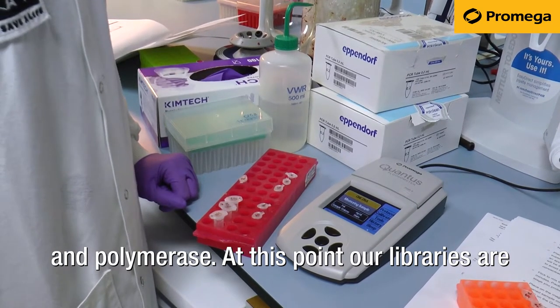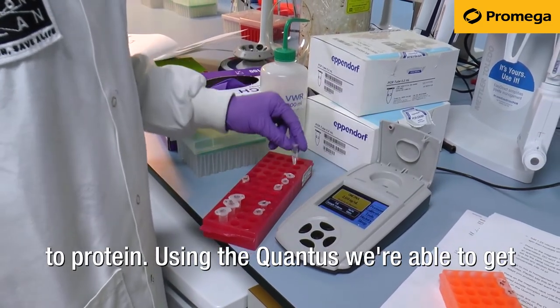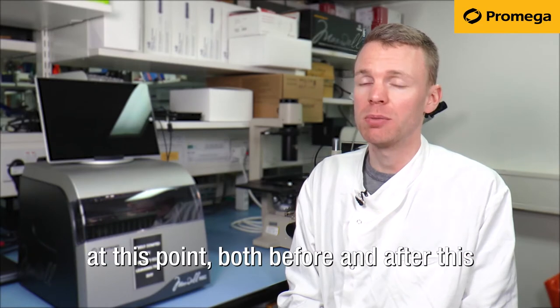At this point our libraries are at a very low concentration and they're bound to protein. Using the Quantus, we're able to get a very accurate measurement of the concentration at this point, both before and after this purification step.